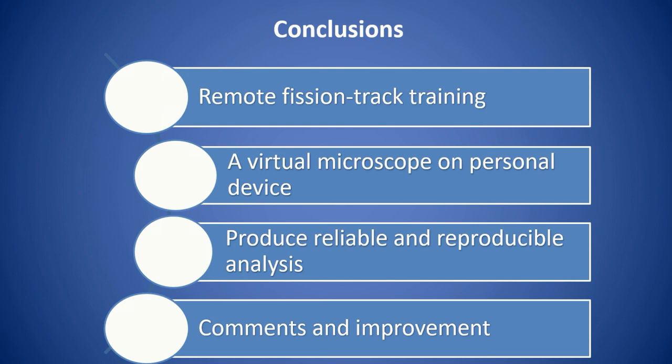What we are proposing here is a training module specific for remote learning. By using a virtual microscope equivalent software, users can carry out the exercise anytime, everywhere. The goal is to equip researchers with the confidence and the skill to produce reliable and reproducible analysis. We understand that all the labs have their own recipes in terms of training. This module is currently being tested on both experienced conventional Fission Track analysts and totally untrained students. We are hoping to reach a version of much improved content and usability in a later stage.